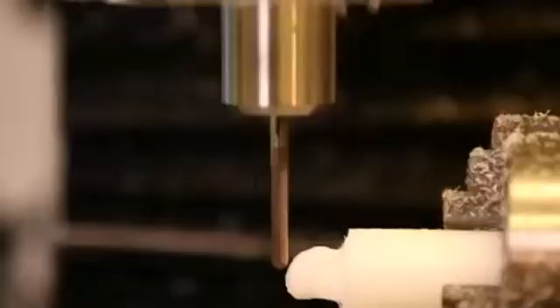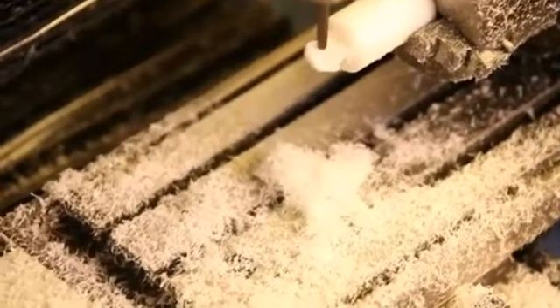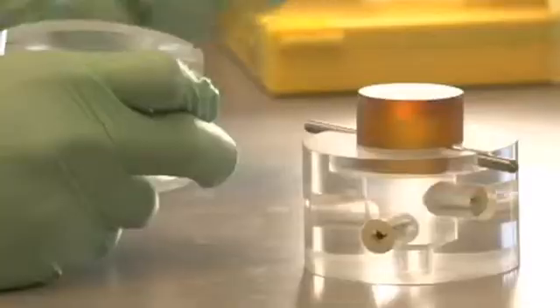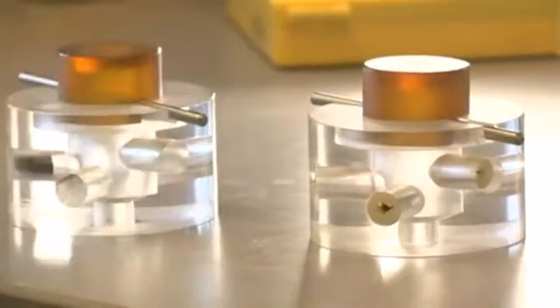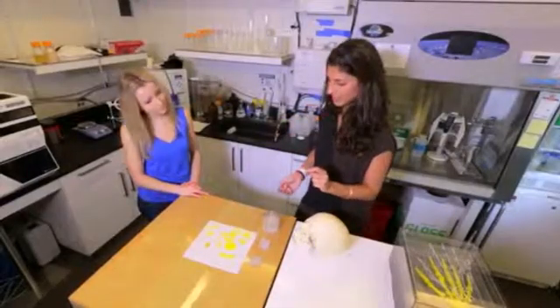First, they take a CT scan of the area that needs the bone replacement. The 3D image is used to create a scaffold made of bone tissue from a cow that's been stripped of all its cellular material. Then a small sample of stem cells is taken from your fat tissue. The structure is housed in a bioreactor where it grows for 3 weeks, after which you could have your own living bone.